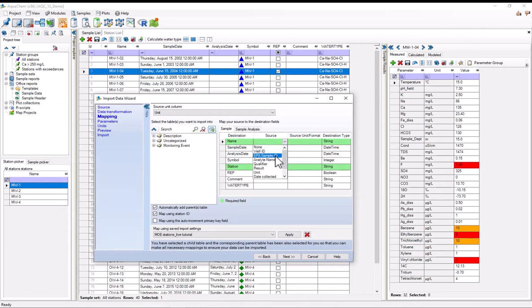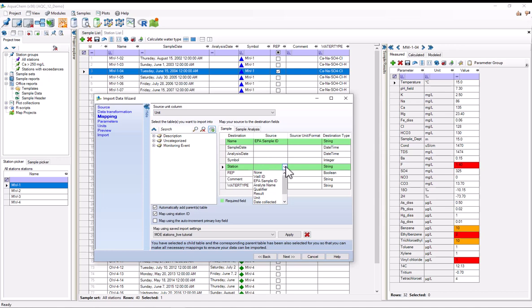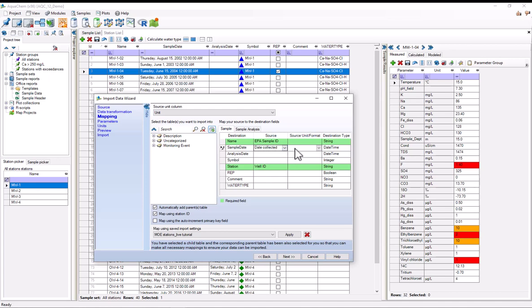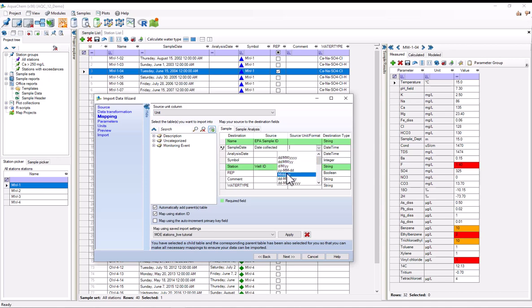So for name, EPA sample ID. And to map this, I'm just clicking on the drop down menu under each row. The station, that's the well ID, and sample date is date collected. So the EPA sample ID and the well ID are both strings, but the date collected is in the date time format. So I need to say what format it is, so I've got to select it. And it's just month, day, year.